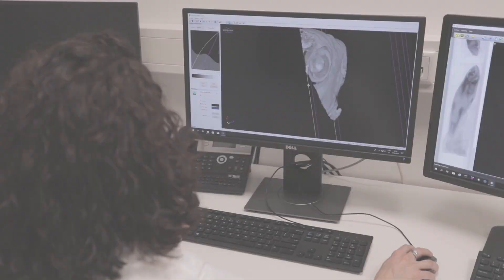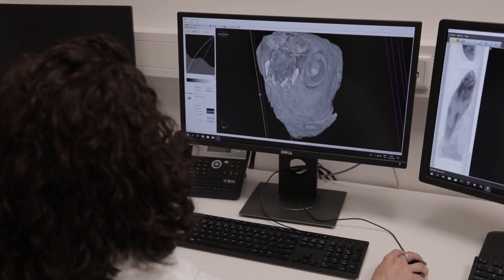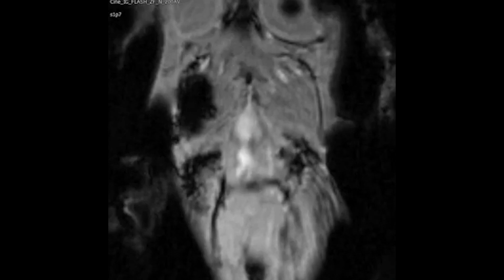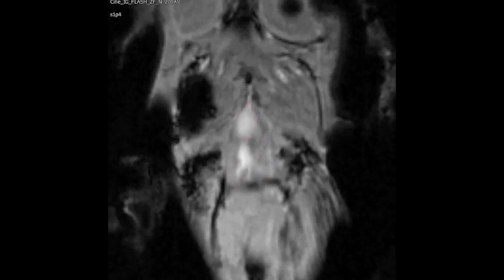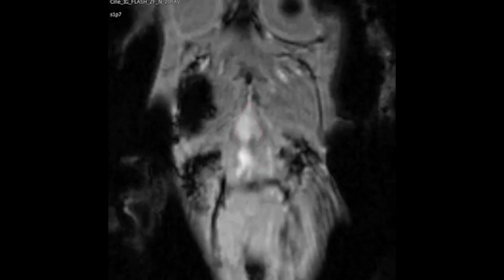We still want to see the heart and the beating heart of the living animal. So we use an IntraGate FLASH sequence, which is a retrospective gating technique. With this technique we don't need any external ECG, and we can detect the physiological functions of the zebrafish using the navigator signal.